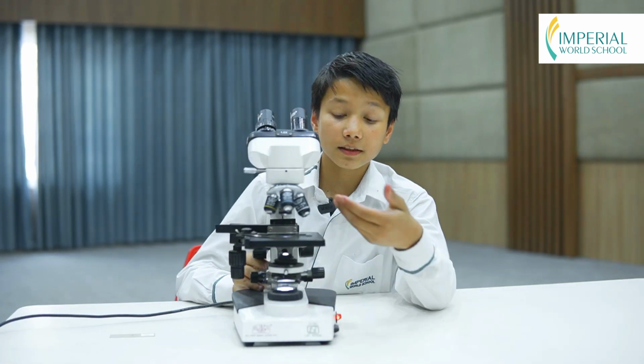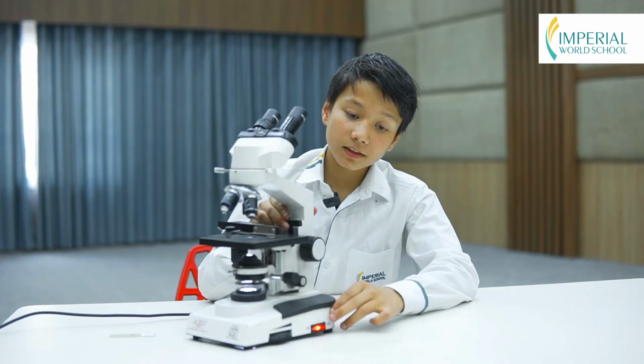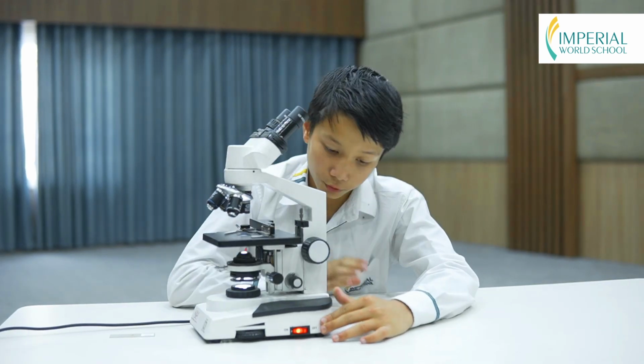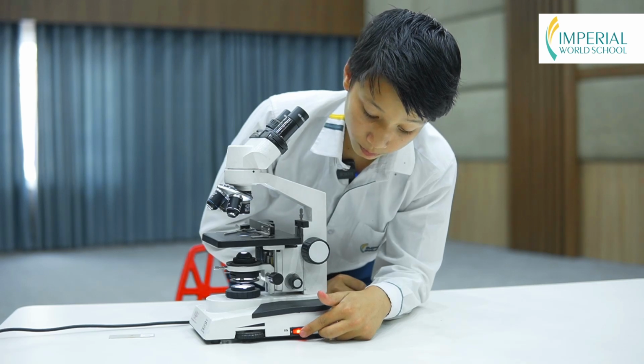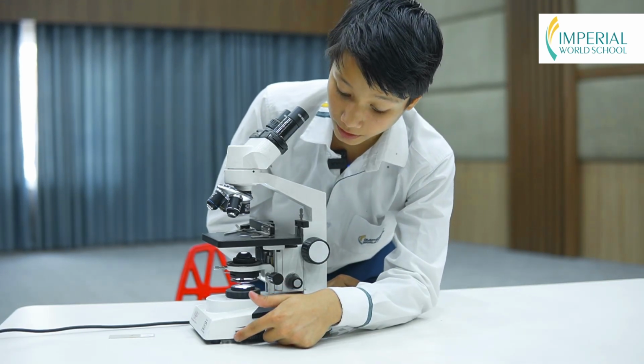Now you can see here, this is the stage where we put our slides. Now this is a light microscope or compound microscope, so there is a switch of this microscope. And you can see here, this is the brightness adjustment.